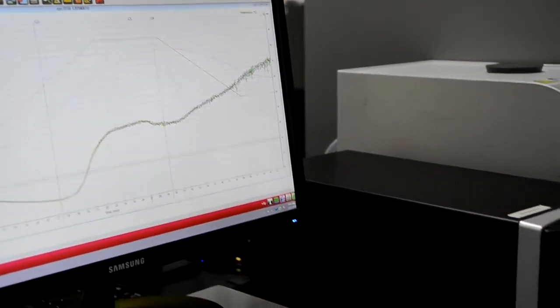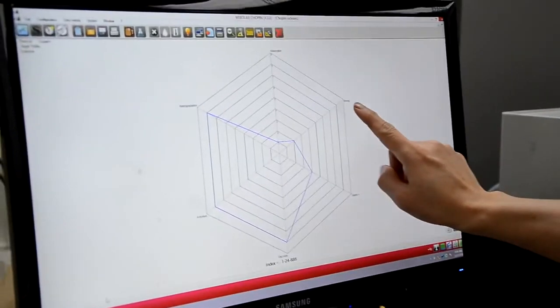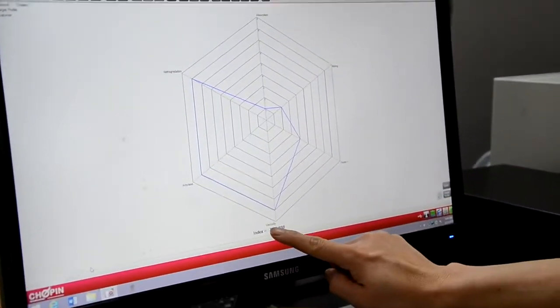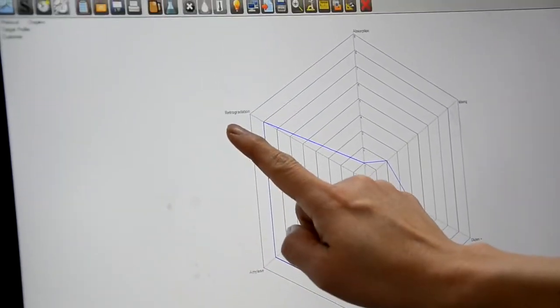What this does is it provides you a spider chart. It shows you the absorption, mixing, gluten, viscosity, amylase activity, and retrogradation.